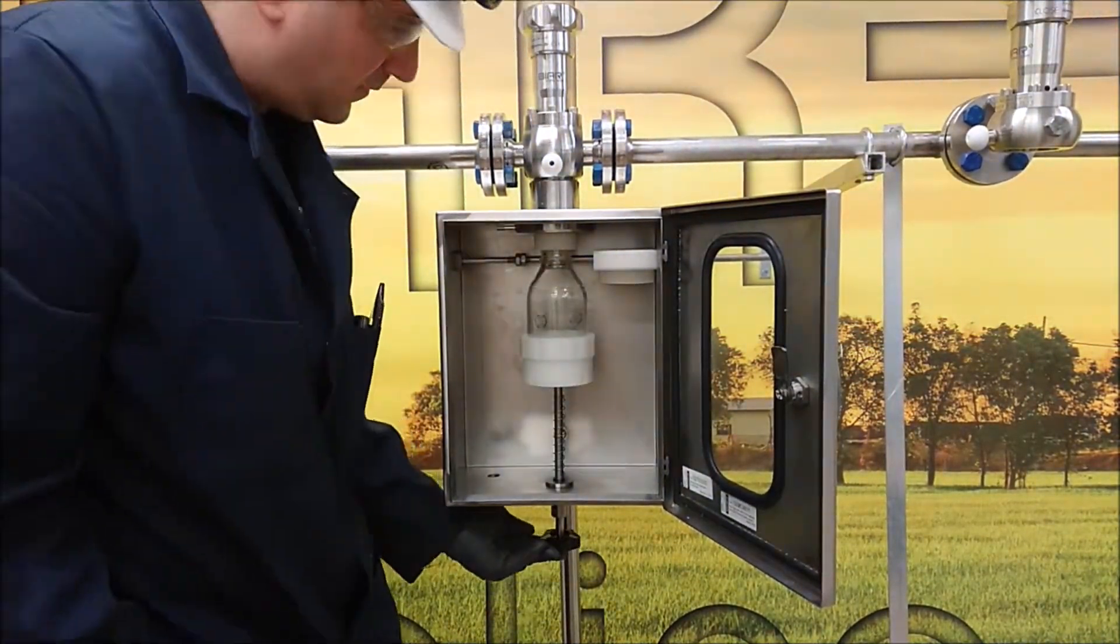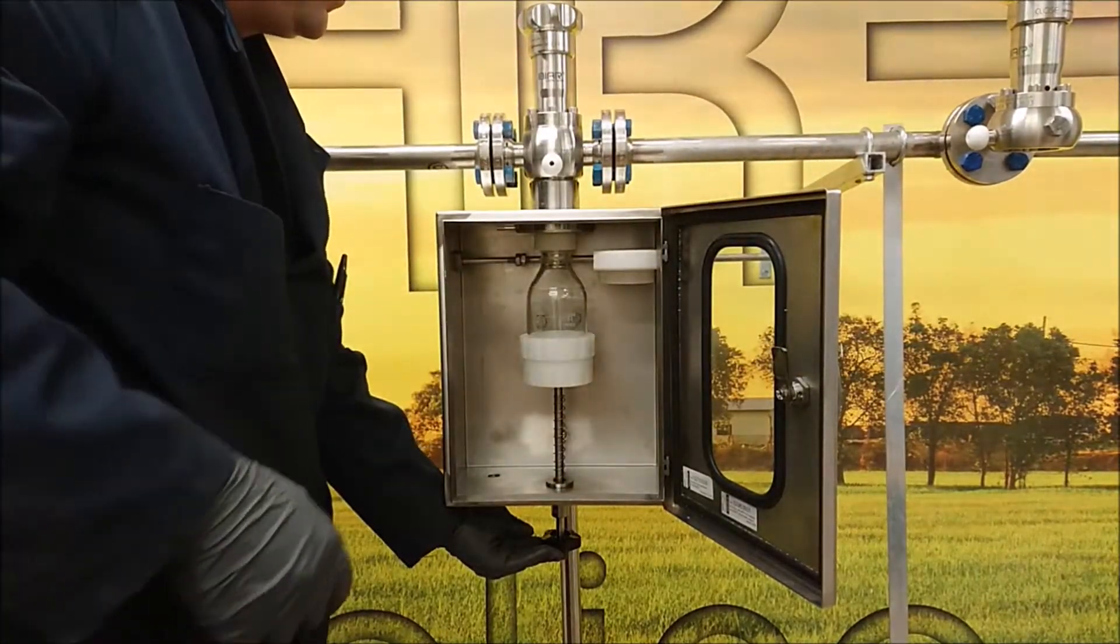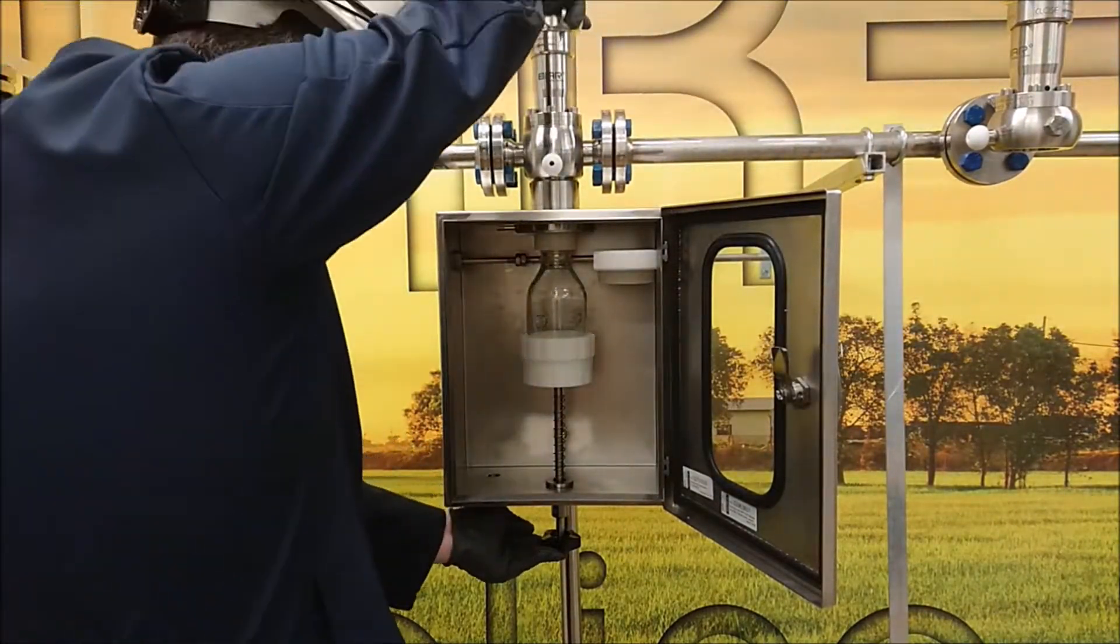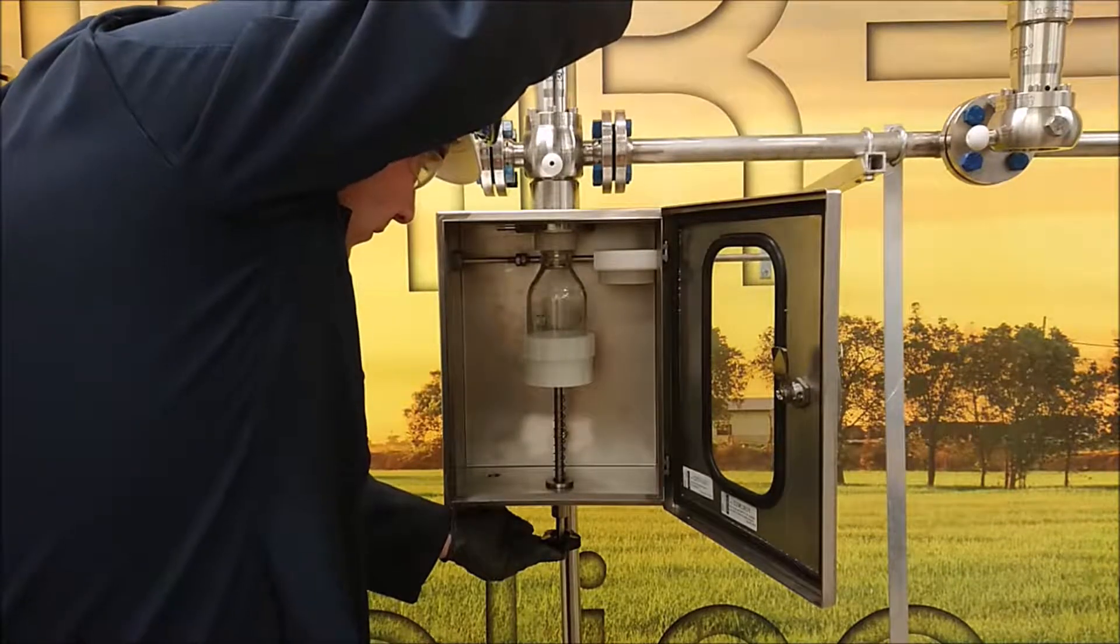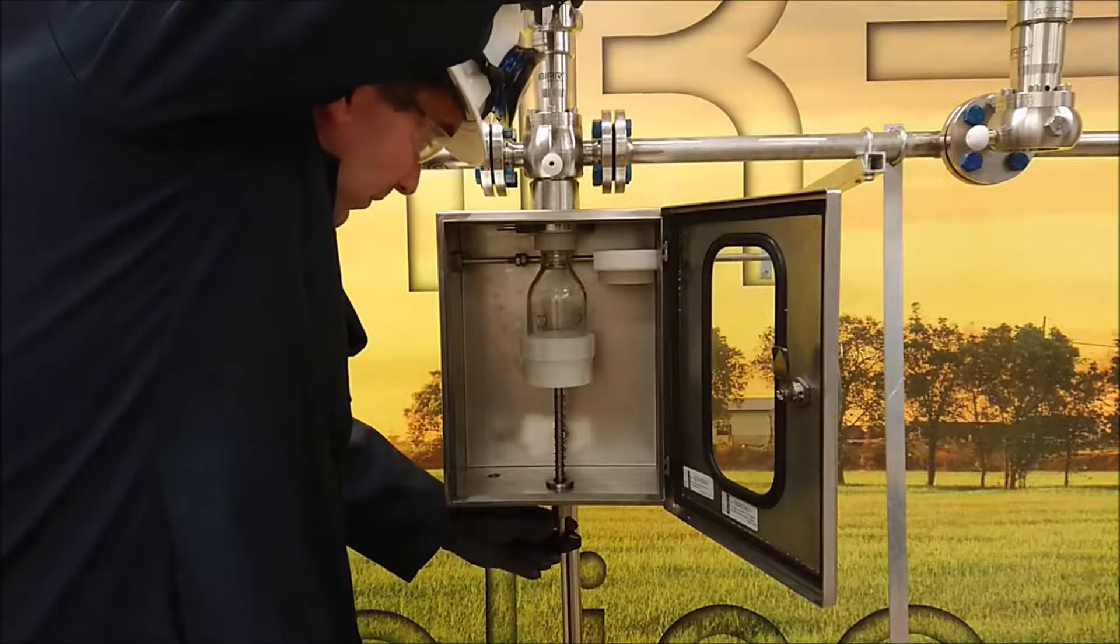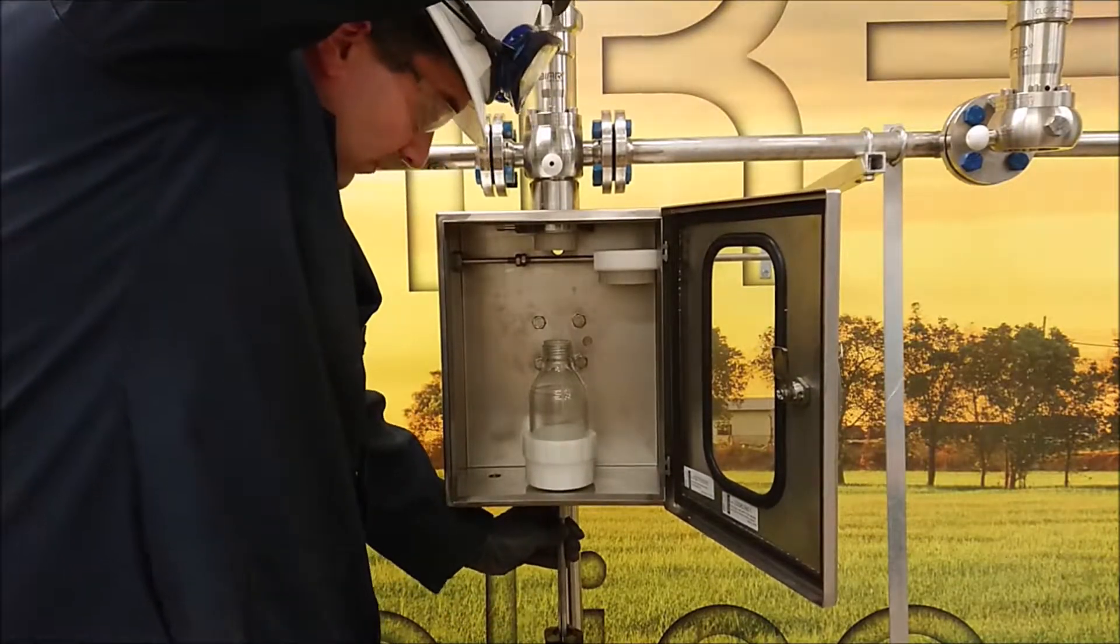The operator lifts the bottle and closes the door. He can now open the valve to grab the sample. Looking in the bottle, he sees how much sample is collecting. Once enough sample is collected, he closes the valves and lowers the bottle.